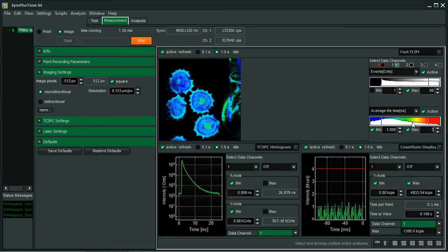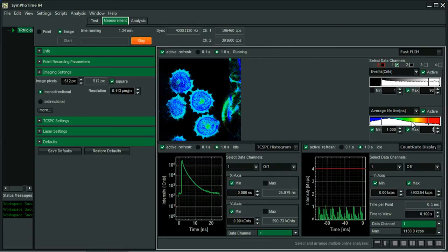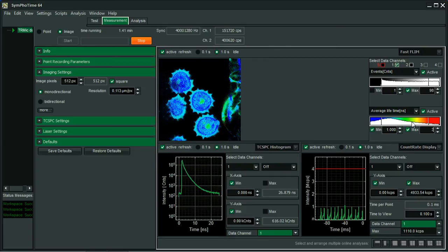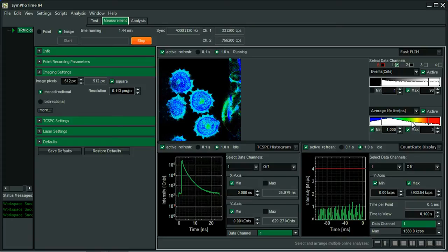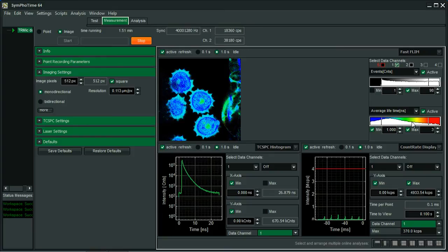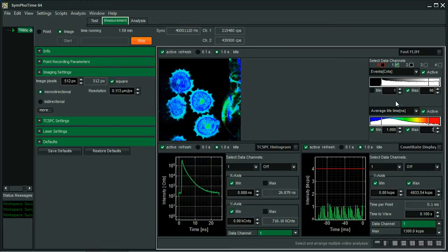Here, I also would like to mention that this FLIM image that we've seen here is online FLIM, so it does not imply any fitting, only the arrival time, the average arrival time per pixel is displayed. But it's already a good estimate if we want to see if we have FLIM contrast or not.